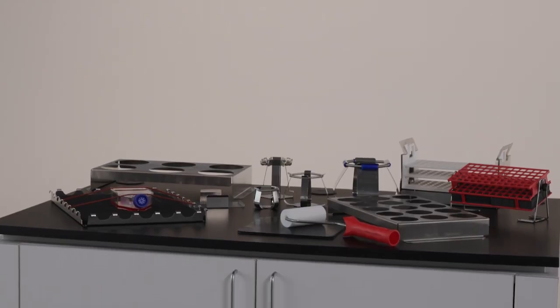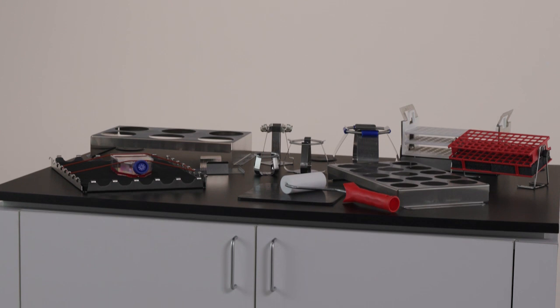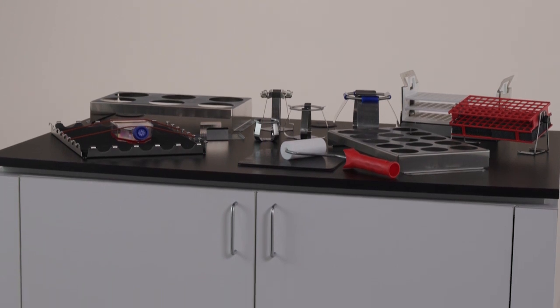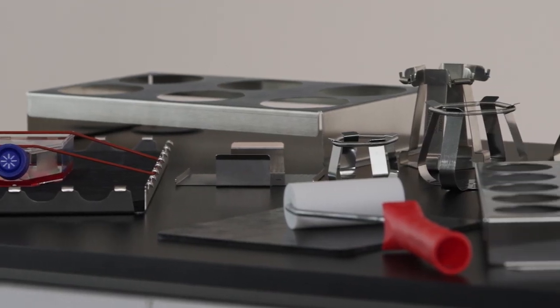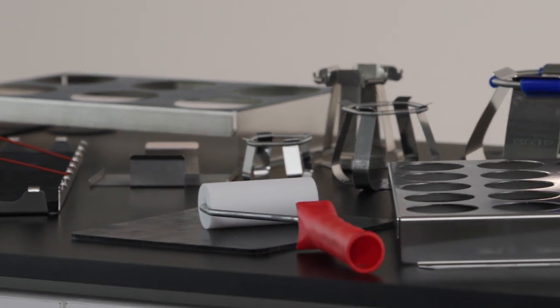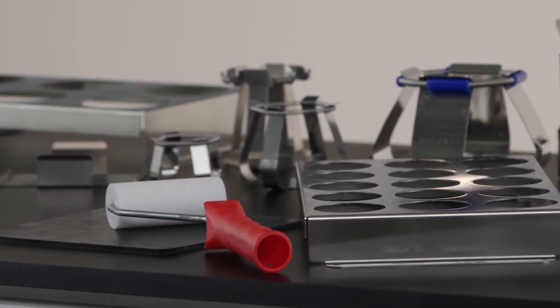Solaris temperature-controlled benchtop shakers are compatible with a wide variety of flask clamps, media bottle clamps, tube racks, beaker racks, microplate holders, vessel clamps, and adhesive mats.